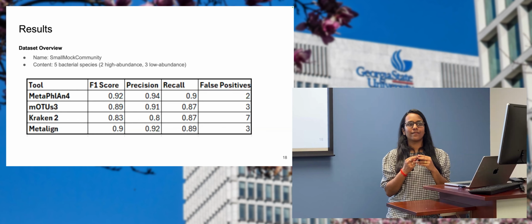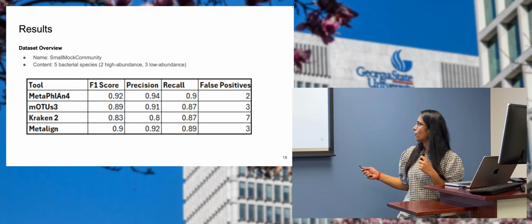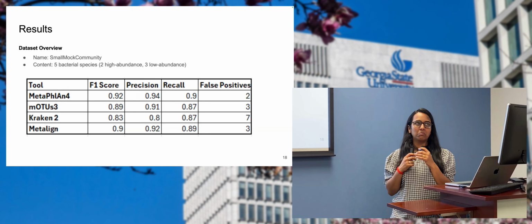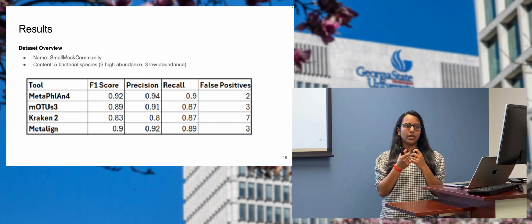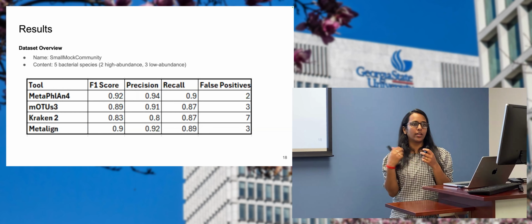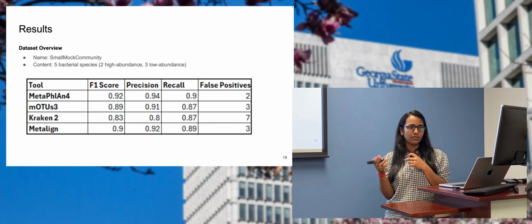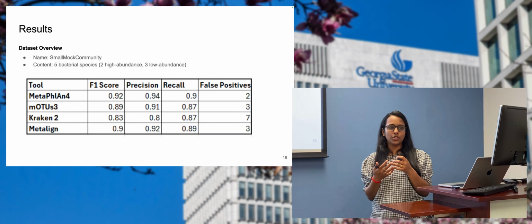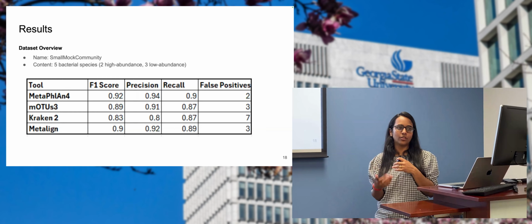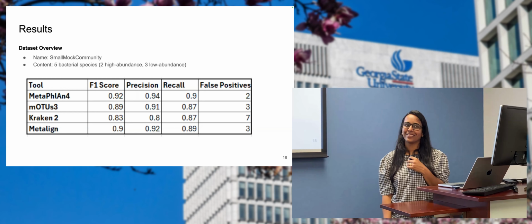Or is it something more? What is the limitation in this field now? What are they trying to do? There is the false positive issue, if you can get more of it. Like I said, you can replace the k-mer and different algorithms with machine learning models. That will make it faster, because it is taking 5 minutes. If you use a machine learning model, it will decrease your run time. Yeah, it's not too much. That's true.